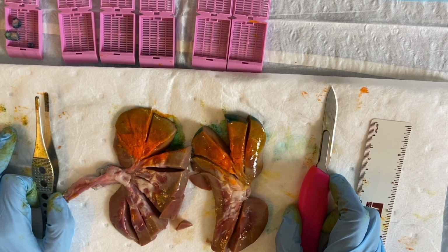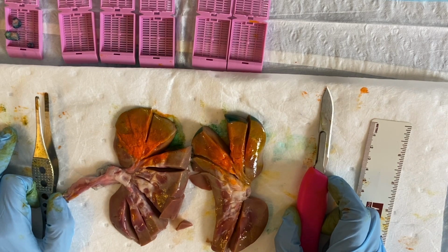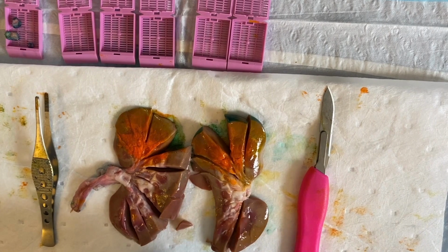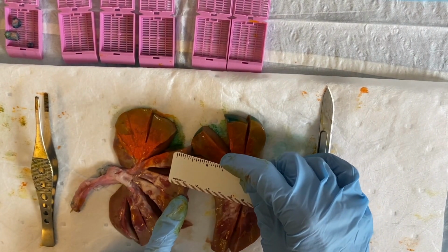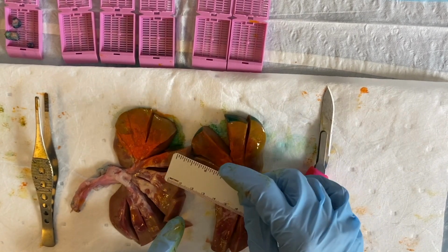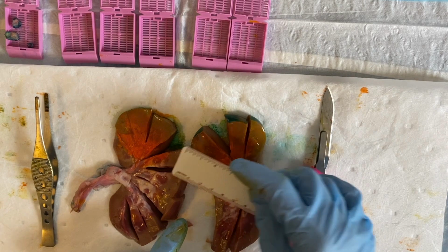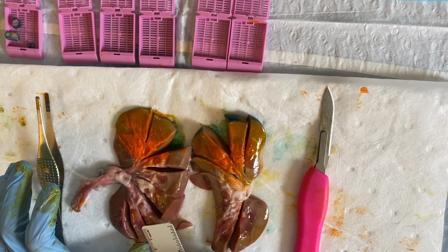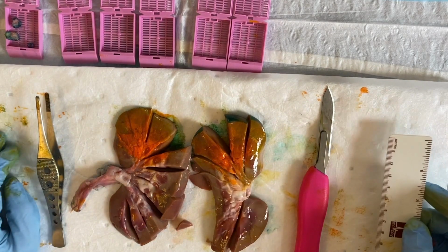I will go ahead and take a few sections to demonstrate how you would continue making your cuts here. But before I do that, I'd like to just talk about a few other measurements that you should take, which would include your cortex thickness. So that is this brown area here. The average cortex thickness is about 1 centimeter. So I would state that looks like maybe 1.2 centimeters.